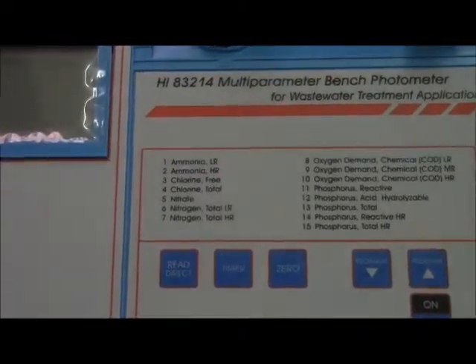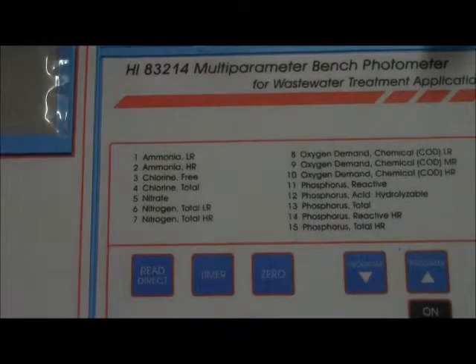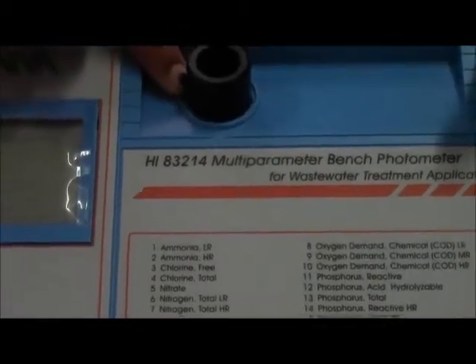15 parameters can be analyzed using this photometer. This is where you place your sample to be read.